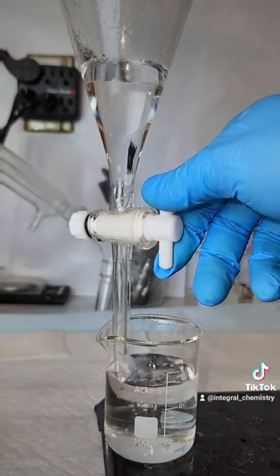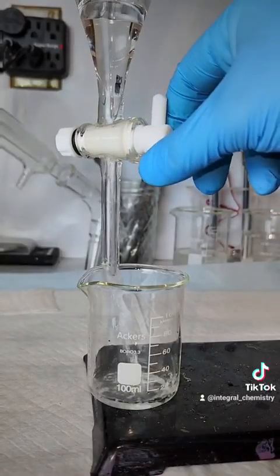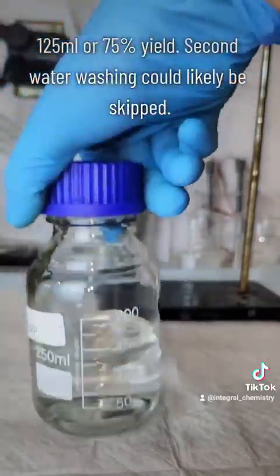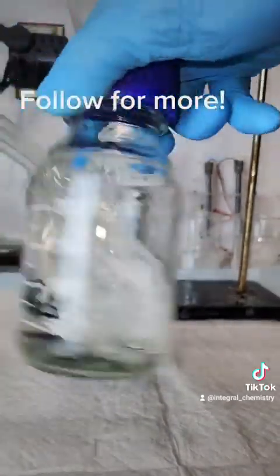My yield here was about 125 milliliters, which represents a 75% yield, which is pretty good for this process. The only way I can think to improve this number is by skipping that second water washing step. I hope you liked this and follow for more.